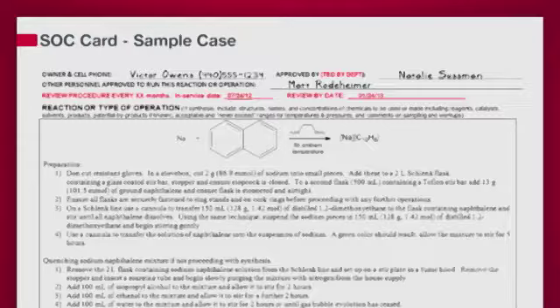And you'll see places to input an in-service date and an expiration date on the card too. These dates help ensure that SOCs are re-examined periodically, and they encourage reviews of ongoing projects at Dow. Our practice is to review SOCs every 6 months.